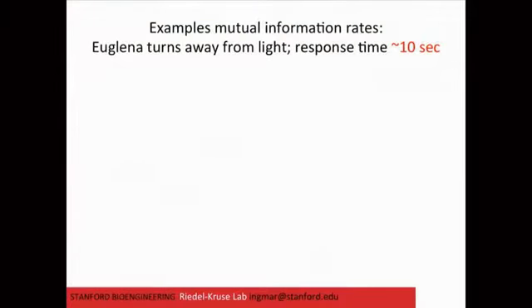The more there is, presumably the more you can interact, or the more people can interact at the same time. To make this a little more concrete, if you just have 2 LEDs, and it takes about 10 seconds for a cell to show a visible response, then you have 1 bit every 10 seconds: within 10 seconds you can say which of the 2 lights has been on. If you have 4 LEDs, then you already have 2 bits.